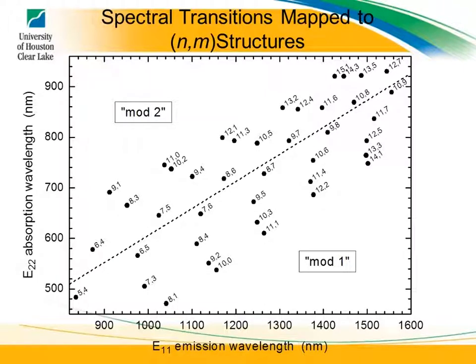But what's interesting is if you, say, have a 650 nanometer laser, like this one. Okay, 650 is still in the red. If you excite, you need a little bit more power than what this one has. But if you excite at 650 nanometers, you can excite 7,5 and 7,6 and probably 9,5 and 10,3. You can excite all of these nanotubes that are close and around that region.